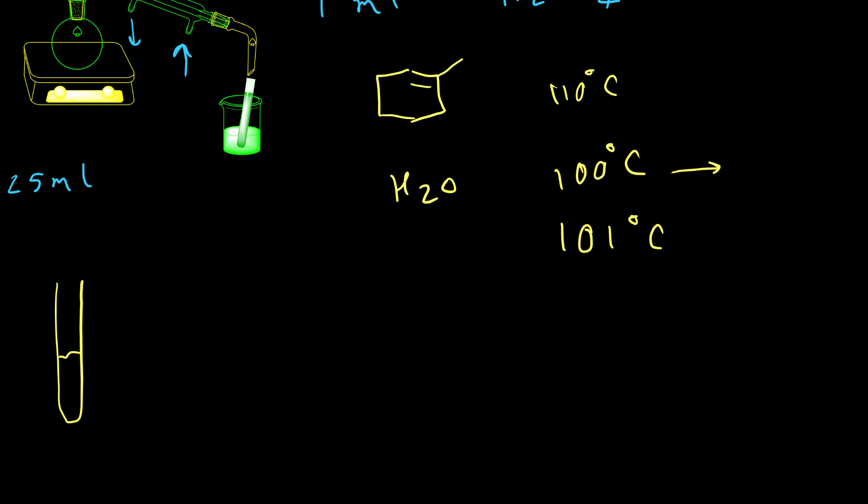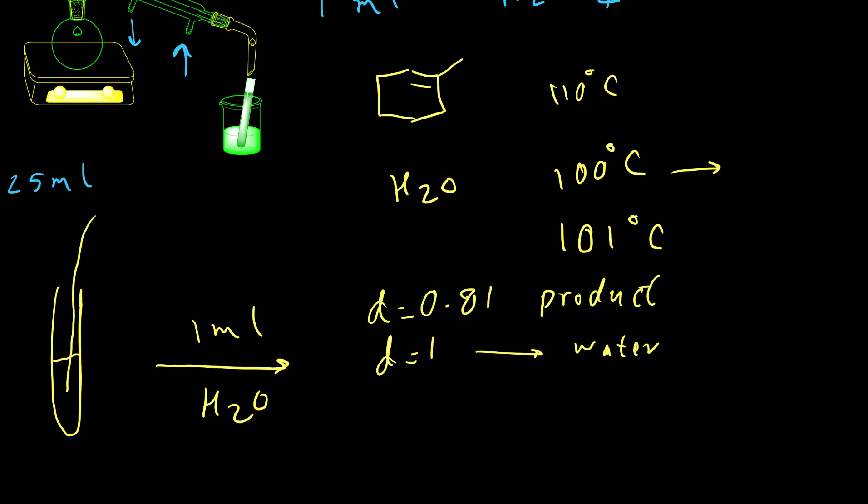After collecting the product inside the tube, first we need to add 1 milliliter water inside the tube. Then close the cap and shake it gently. Once two layers separate from each other again, we need to remove the aqueous phase by pipette. Keep in mind, the density for the product is 0.81 and density for water is 1. So the lower layer is aqueous or water and the top layer is our product. When we want to remove water, we need to put a pipette inside the lower layer and just remove the lower layer.